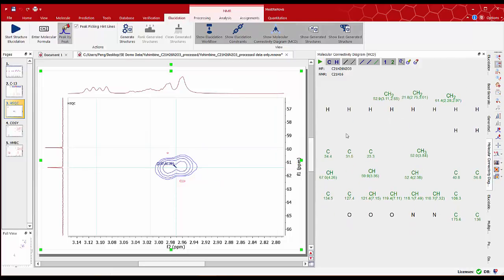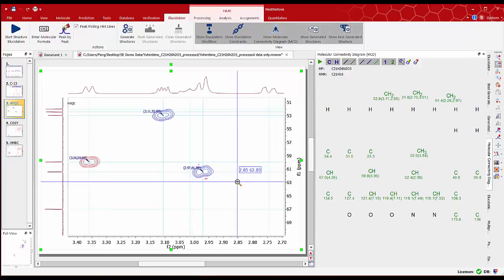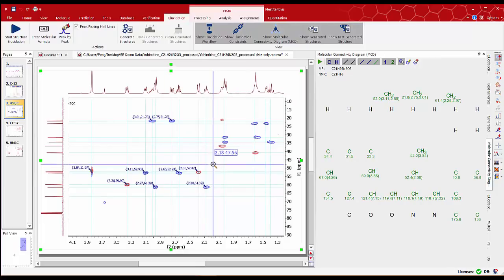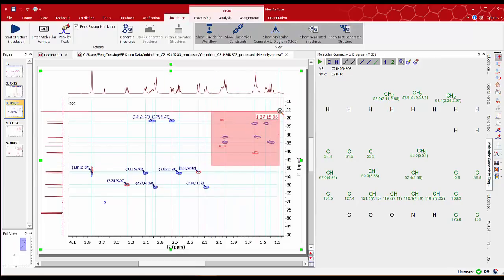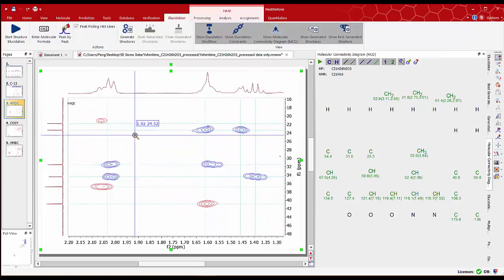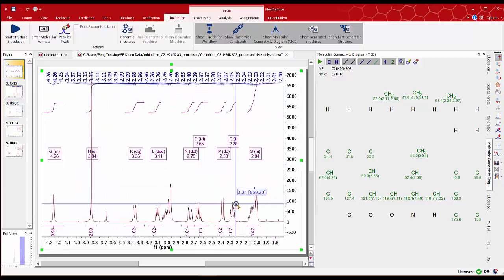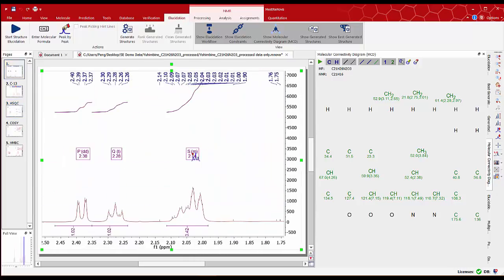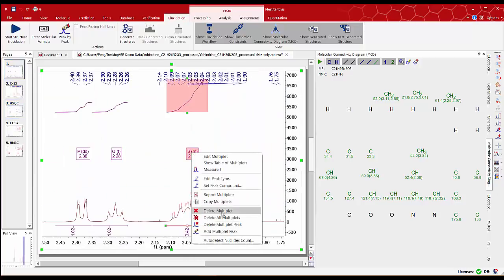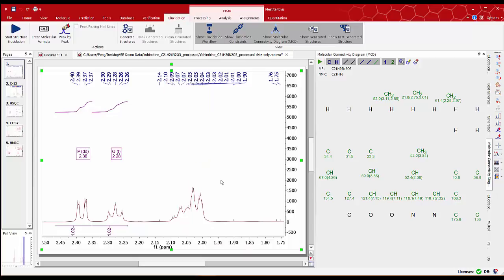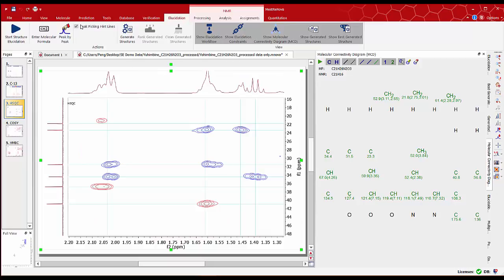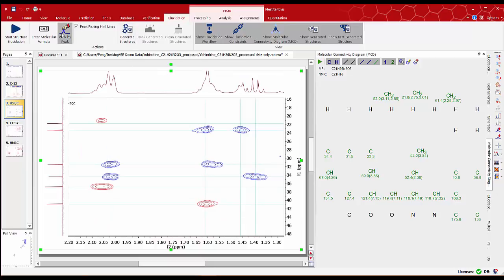Zooming into a different region we see some more overlap protons. We can remove the integral on the 1D proton spectrum doing mouse right click and select delete multiplet. Then back to the HSQC. Refresh the peak picking hint lines. And do a manual peak by peak analysis as before.